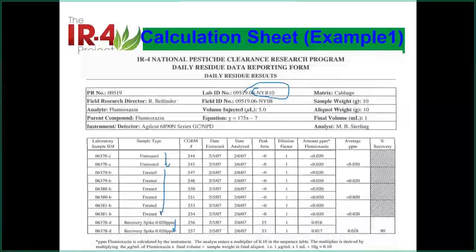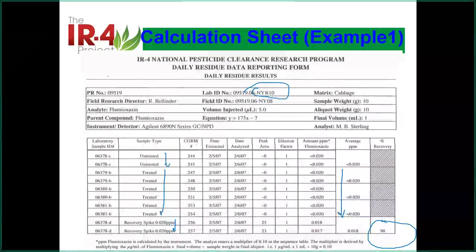And you will see we see the recovery down here, and we see all the numbers. Of course, the treated sample in this case is very low, lower than the LLMV, so you don't care about anything. Even if the numbers are different, you don't care about that because it's below the LLMV. So that's this part. And of course, we have a lot of sample information there and all the data down here.